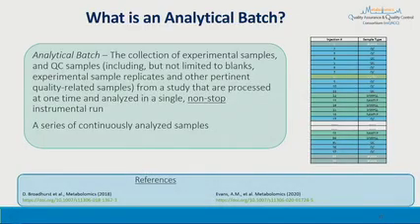What is an analytical batch? It's the collection of experimental samples and QC samples, including but not limited to blanks, experimental sample replicates, and other pertinent quality-related samples from a study that are processed at one time and analyzed in a single, non-stop instrumental run. It's a series of continuously analyzed samples.